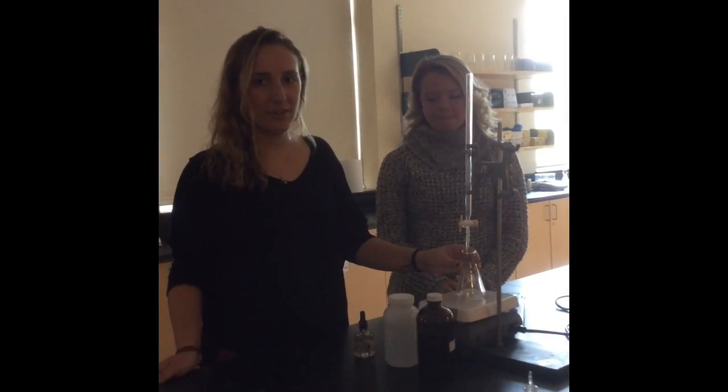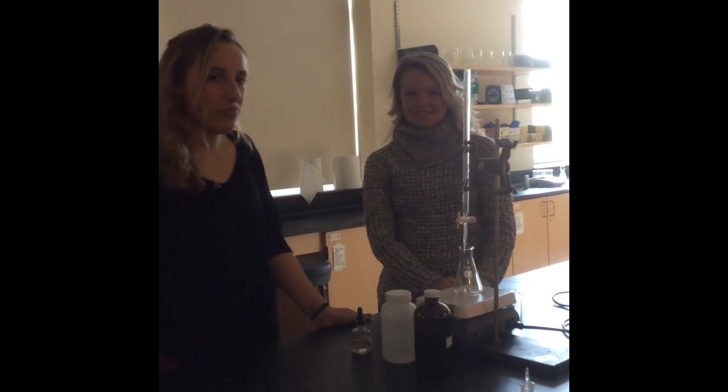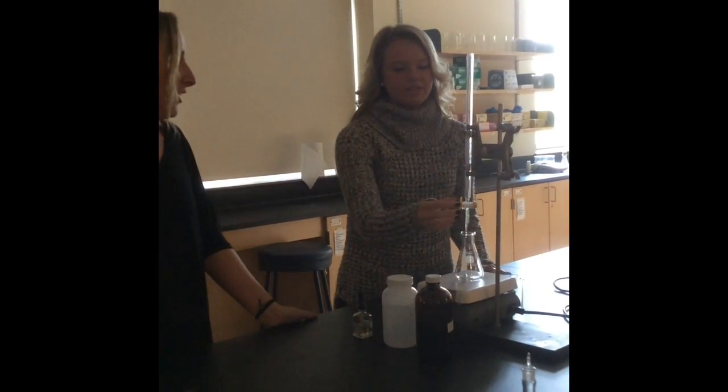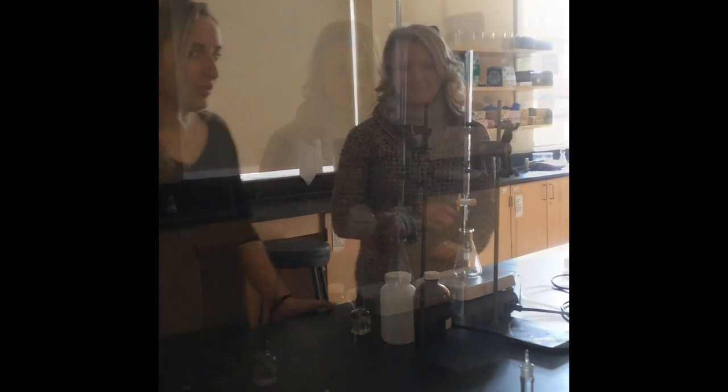Make sure the flask is centered in the stir plate. Align the burette tip so the liquid will dispense into the flask. Check to make sure that you have your titrant, the solution that is going into the burette, and your titrand, the solution you'll be analyzing in the flask. Make sure the burette knob is facing horizontal so that the liquid will be controlled.